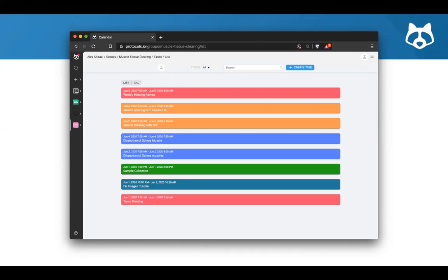And so as you can see, the list of tasks are outlined here, and we'll be getting into this a little bit more, but this would be very helpful for any type of weekly meeting or planning session where we kind of look to see and identify what's missing.